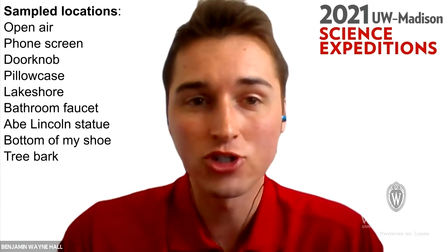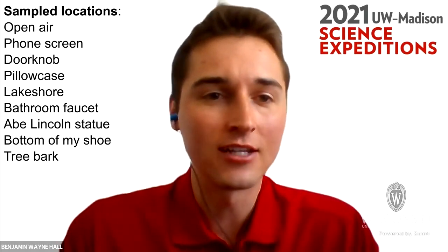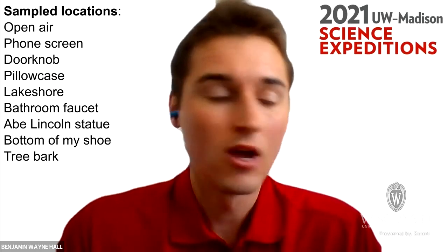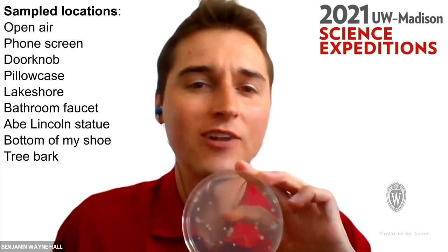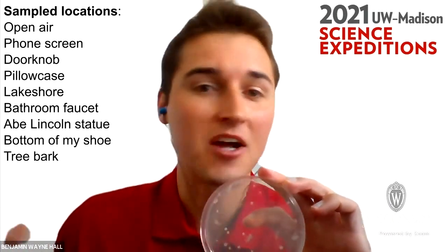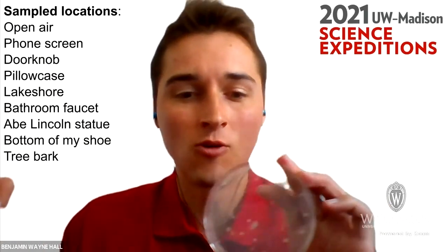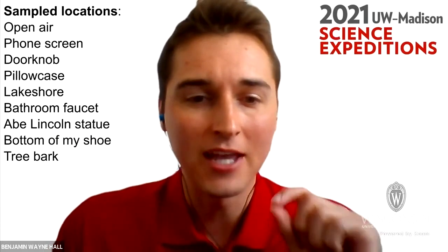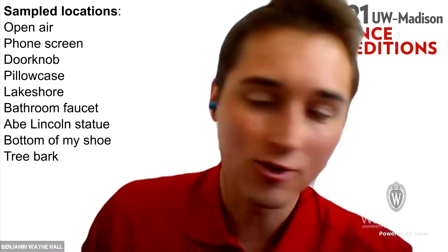But I have walked on the lakeshore in the past in those shoes. Some bacteria can survive in certain environments even without food for a long time. So I might have picked up these bacteria on the bottom of my shoe yesterday, 2 days ago, a week ago, who knows? They were just waiting on the bottom of my shoe for the right time and the right food before they started growing again. So that was a great prediction.